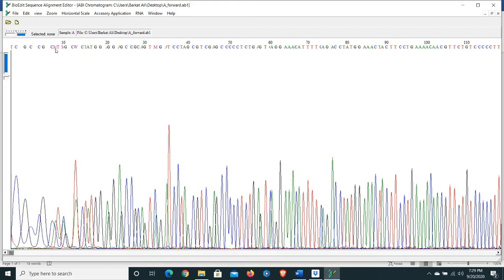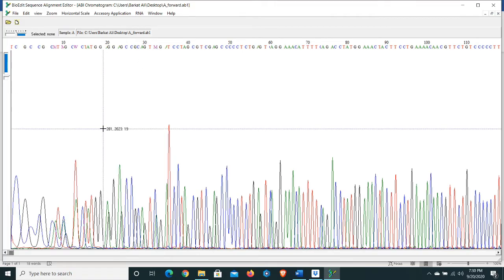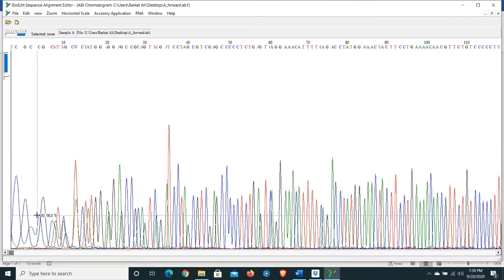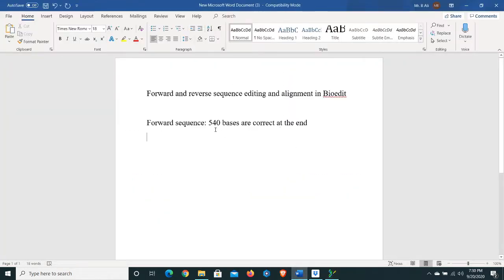At the beginning you can see there are some ambiguous bases — M, M, W, and again M. Positions 30, 31, 32, 33 — so about 32 bases are not good, as they contain ambiguous bases. Also up to position 10, the waves are not fine either. So we will delete these bases. About 31 bases are not correct at the beginning.